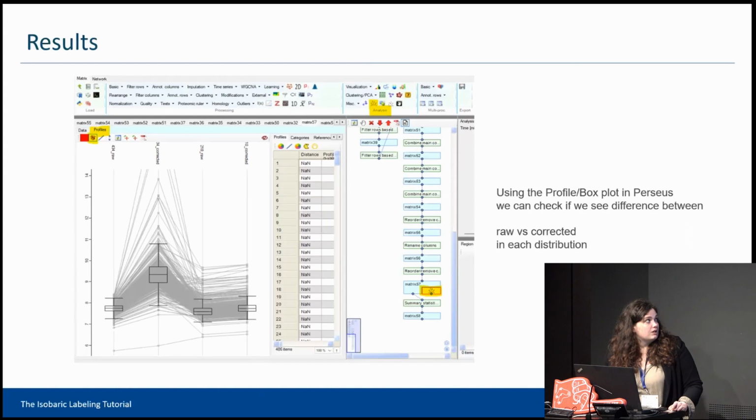And you can see from here that you see exactly a difference. So the first line is the carrier level for 134, the raw one, and the second one is the same one corrected. And then you see the raw one, 210, and then you see the corrected, and you can see exactly that difference.